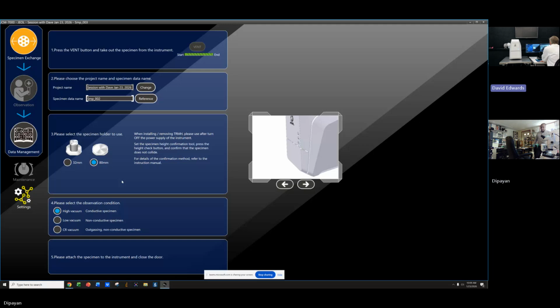If you're talking to me, I can't hear you. There is no USB coming to the SEM. Maybe there is USB going to the PC side.